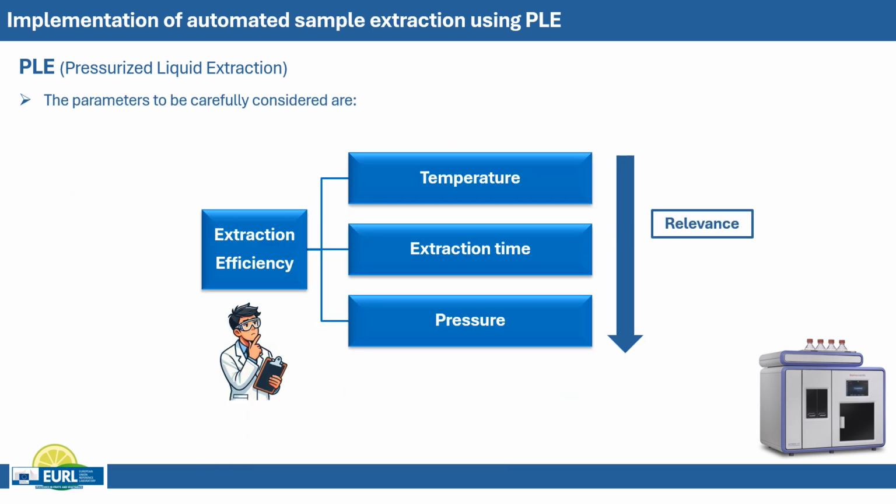The parameters to be carefully considered are temperature, extraction time, and pressure in order to optimize extraction efficiency.